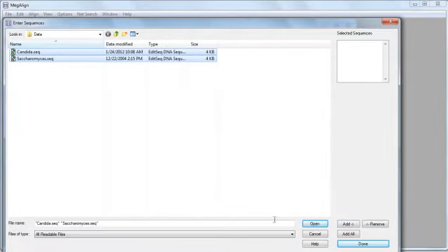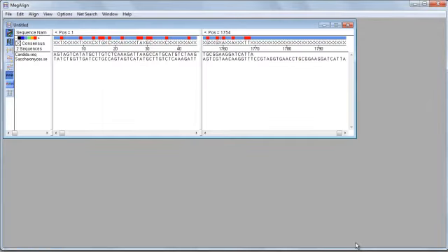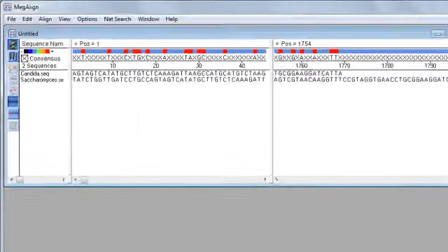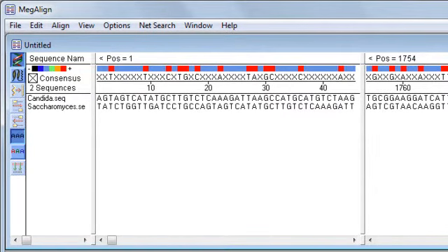Now you can perform a dot plot alignment using any two sequences, protein, DNA, or a combination of the two. For this example, I'm using two DNA sequences for the 18S ribosomal RNA gene from two different kinds of yeast.